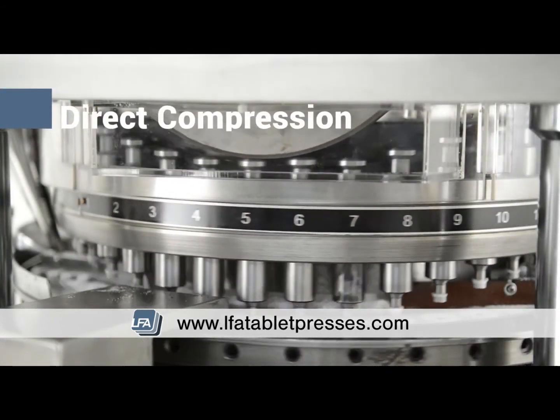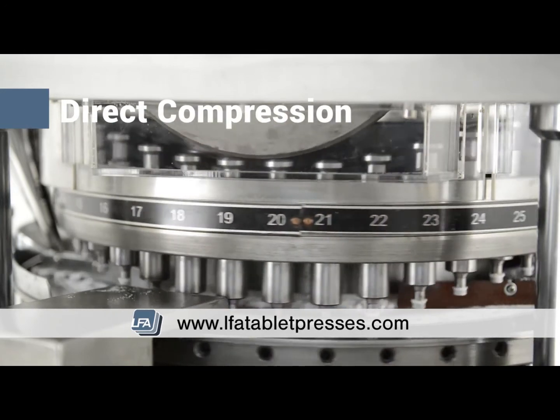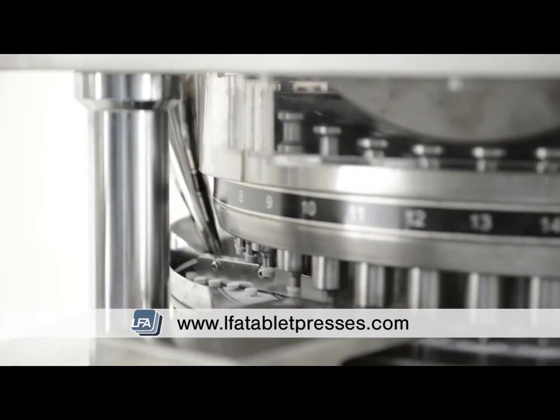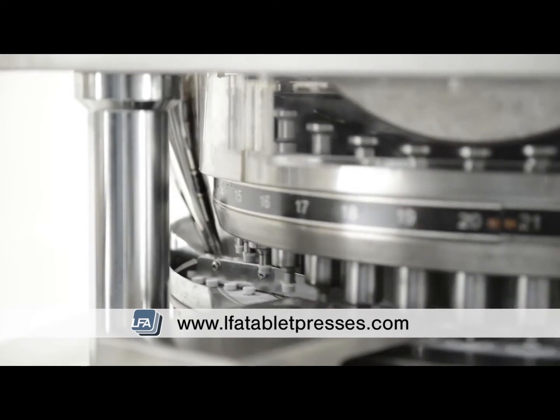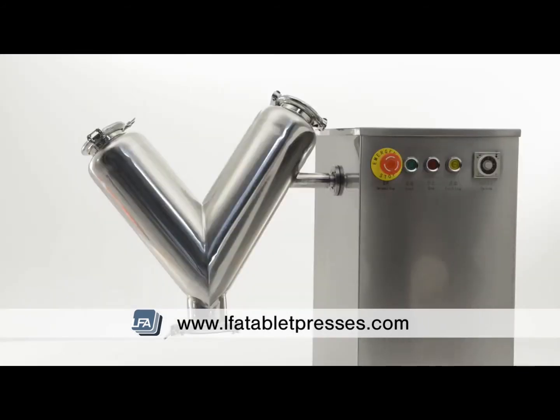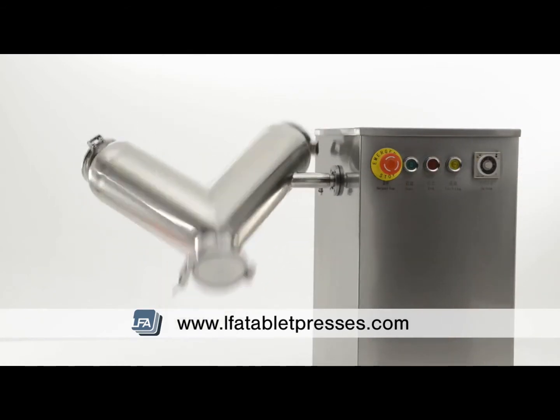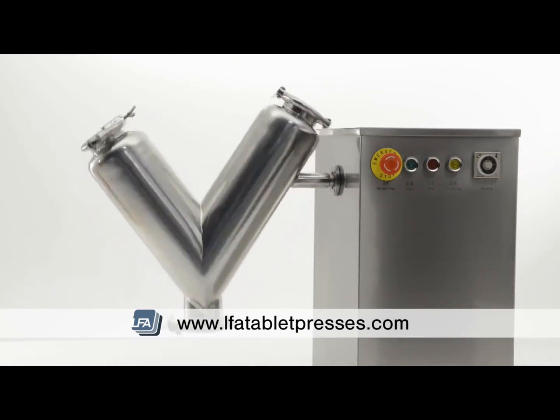Direct compression. In tableting, sometimes your tablet formulation needs neither dry granulation or wet granulation and can be directly compressed. This is the most cost-efficient process within tableting. Your API and your excipients needed are taken and added to a mixer. Once blended, they can be compressed in your tablet press with no further steps.